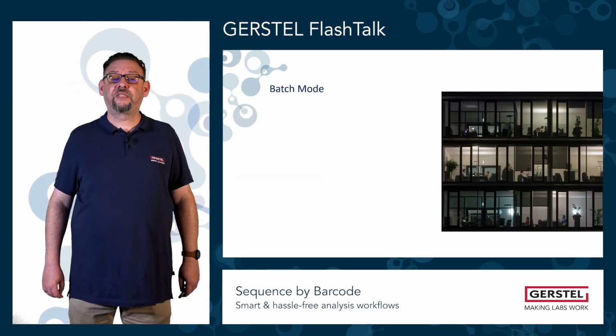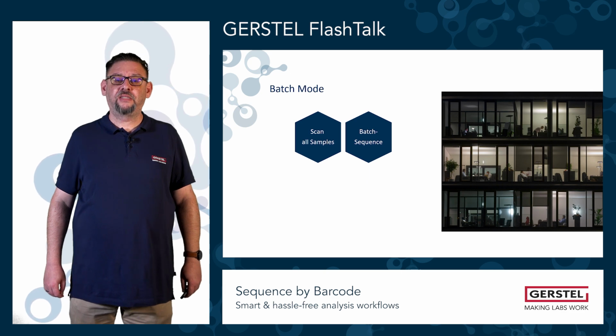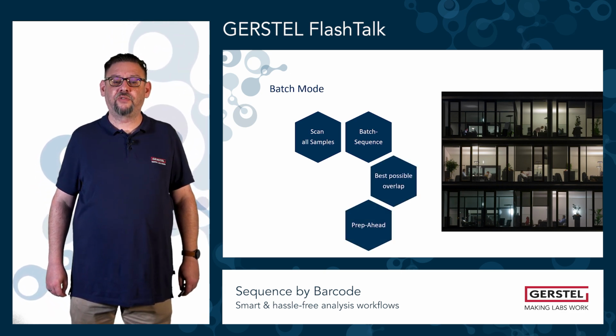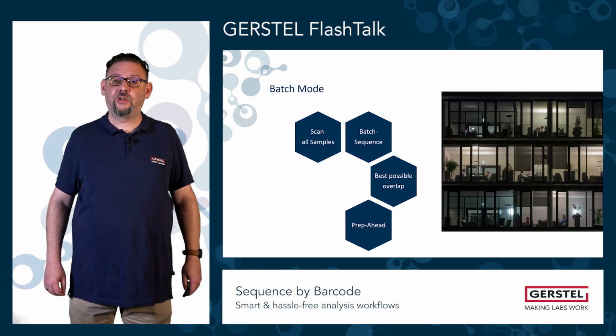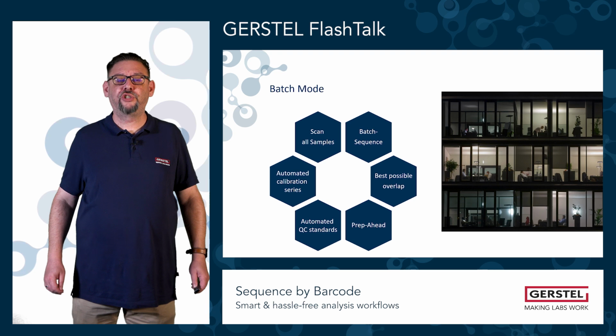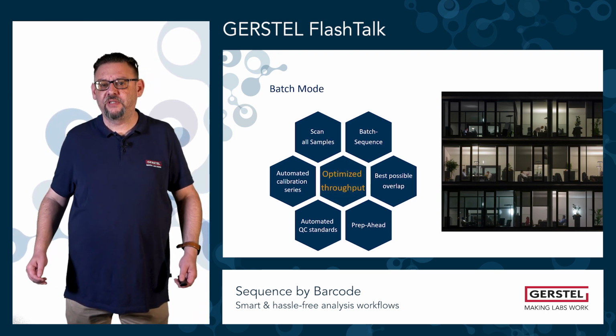In the batch mode, we are scanning all samples and working in so-called batch sequences. This allows for the best possible overlap using the prep-ahead mode of the Gerstl Maestro software. In addition, you can also add QC standards or use automated calibration series. In this mode, we can reach the highest possible throughput of the system.